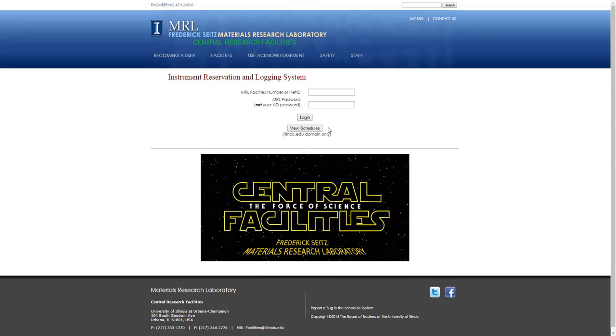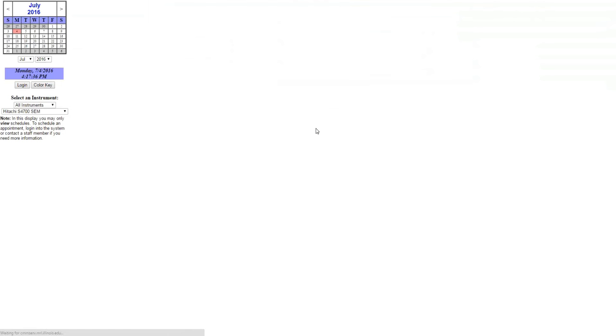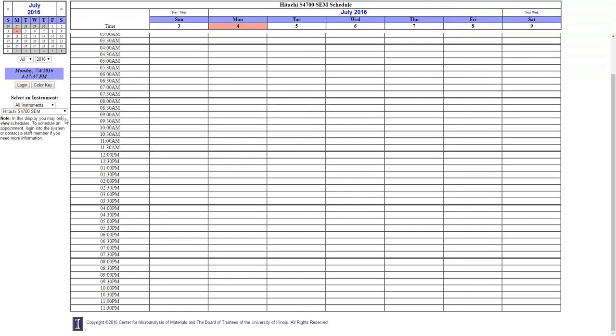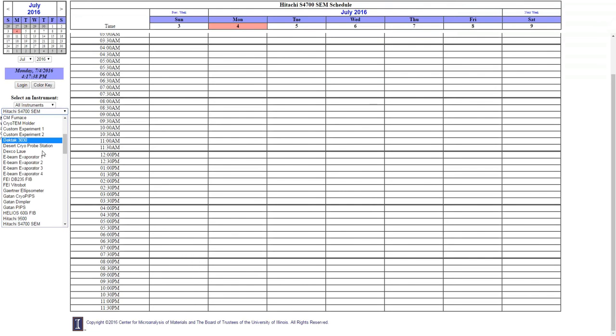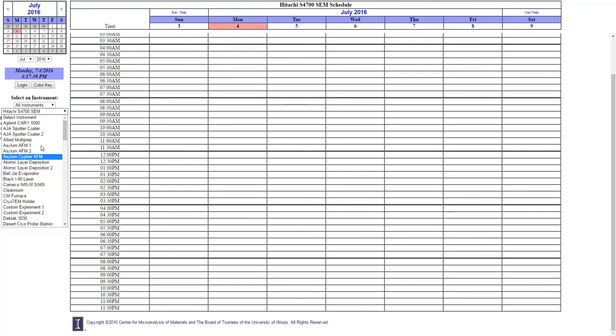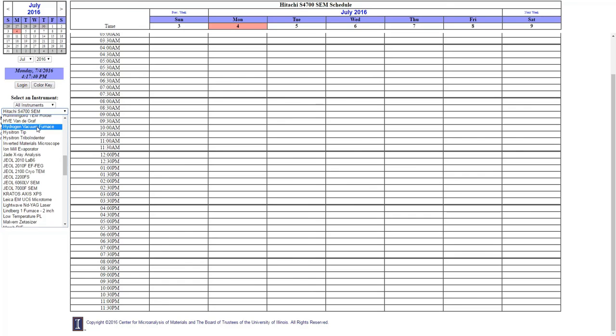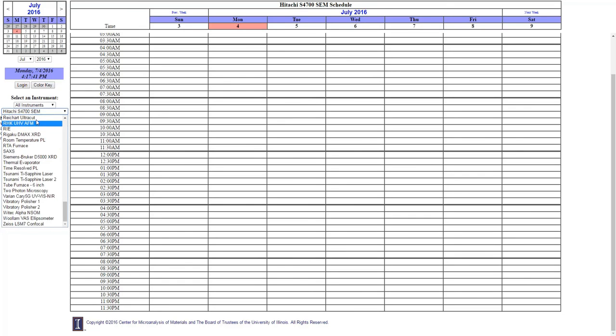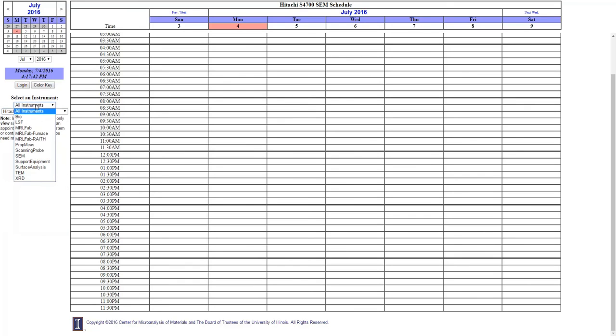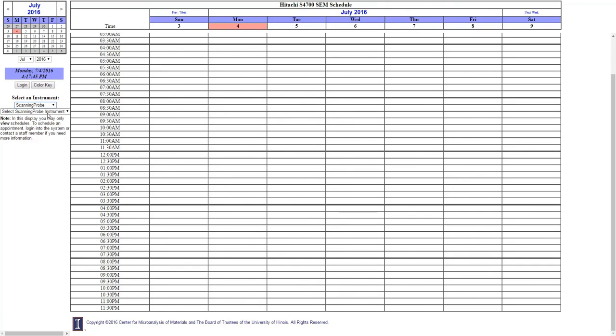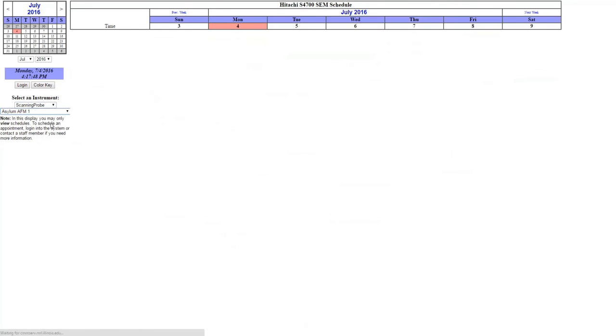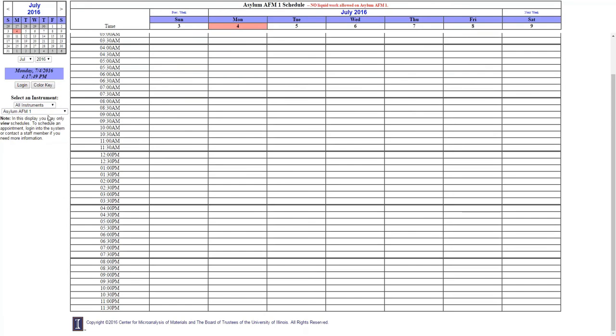In the middle will be announcements. Even if you're not logged in, if you're on the Illinois campus, you can view any instrument schedule. The instruments are listed alphabetically in one big long list, or you can select a smaller grouping of instruments and select from that group to choose which instrument you want to look at.